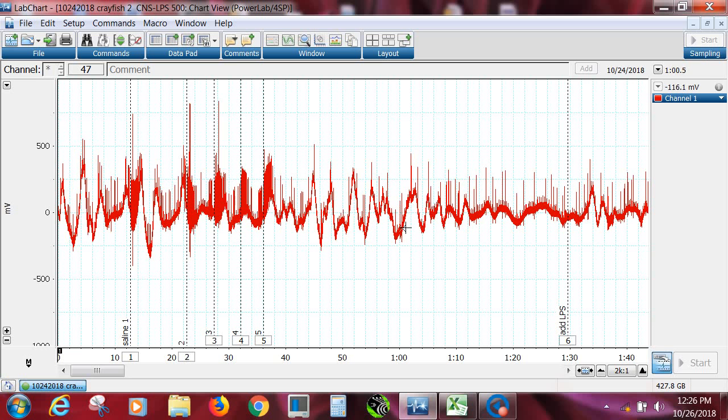Notice the baseline here wiggles up and down, and then you have spike activity on top of that. This wiggling can't really be avoided in these animals too easily, because the whole abdomen is in the dish and the little swimmerets are still moving around, or the animal can move its abdomen a little bit even though it's cut away from the thorax. Movements like those swimmerets cause the saline to move around, and that causes these deflections in the recording.